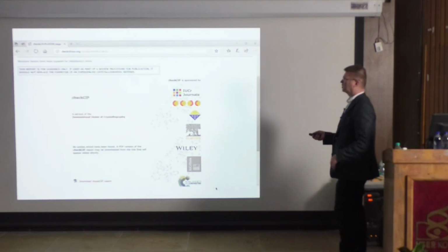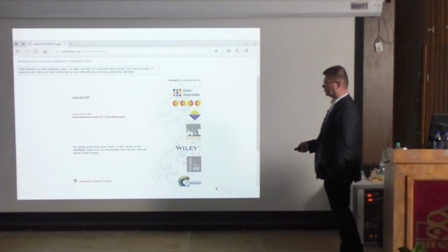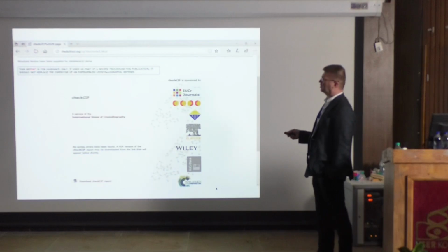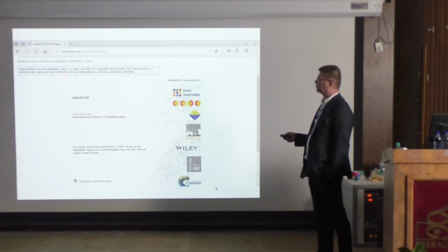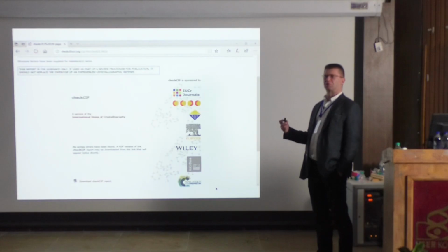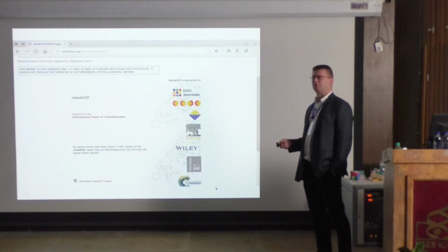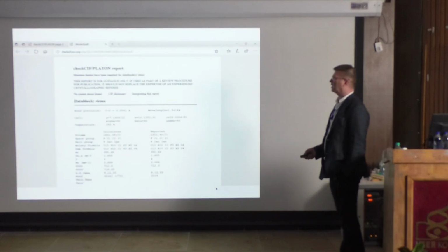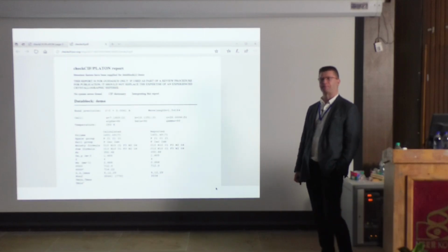So what it does is going, and then it says this is now done. Here is the report, download, CheckCIF report. You click this, it downloads to you. But the point is that there is a warning which says this report is for guidance only if used as a part of a review procedure for publication. It should not replace an expertise of an experienced crystallographer. So even if you do this, it might be the case that there will be somebody who wants to get even deeper in your structure and see if there's any errors. But normally that will be enough.